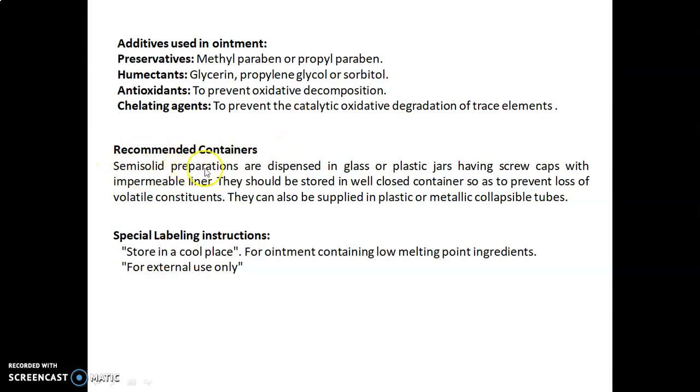Recommended containers: the semi-solid preparations are dispensed in glass or plastic jars having screw caps with an impermeable liner. They should be stored in a well-closed container so as to prevent the loss of volatile constituents. They can also be supplied in plastic or metallic collapsible tubes.